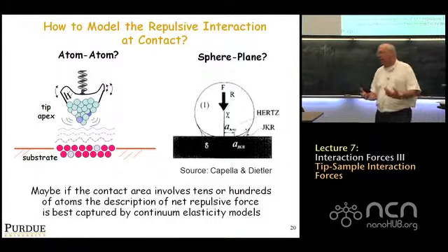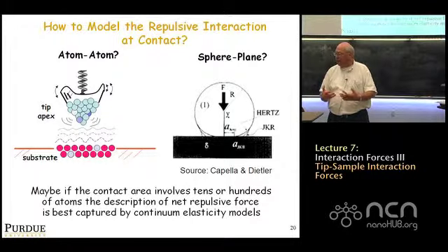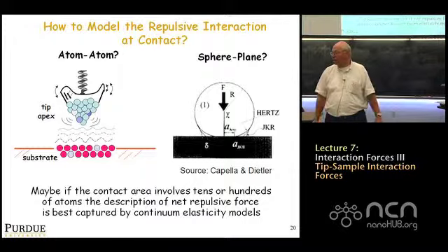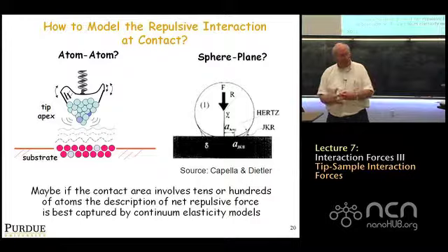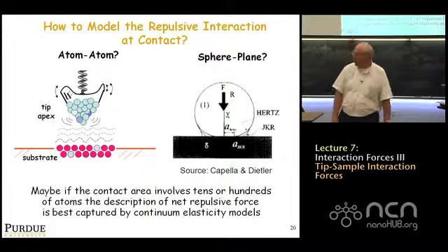So you don't have to write computer programs to interpret your data using these models. You can actually use the mathematical models that are already in the Veda software to try to explain the liftoff forces, let's say, that you measure experimentally between the tip and the substrate. There's going to be about 2 or 3 lectures just on Veda in the future in this course, and so we'll get into that in much more detail.